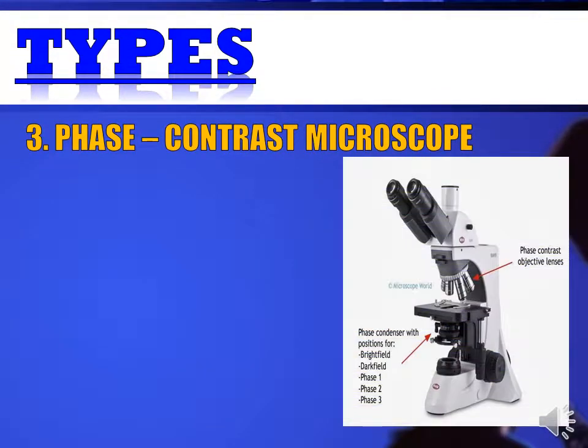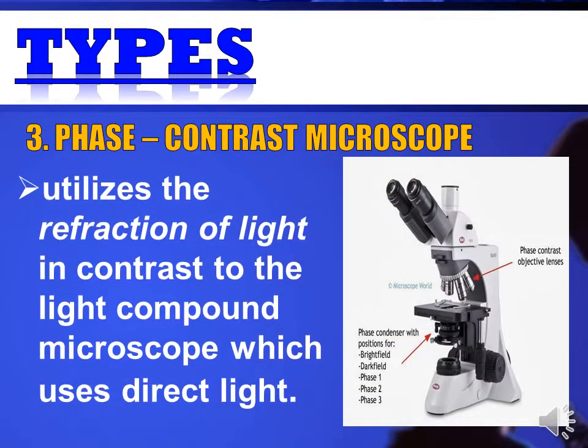This is a phase contrast microscope. It utilizes the refraction of light in contrast to the light compound microscope, which uses direct light to view the specimen.